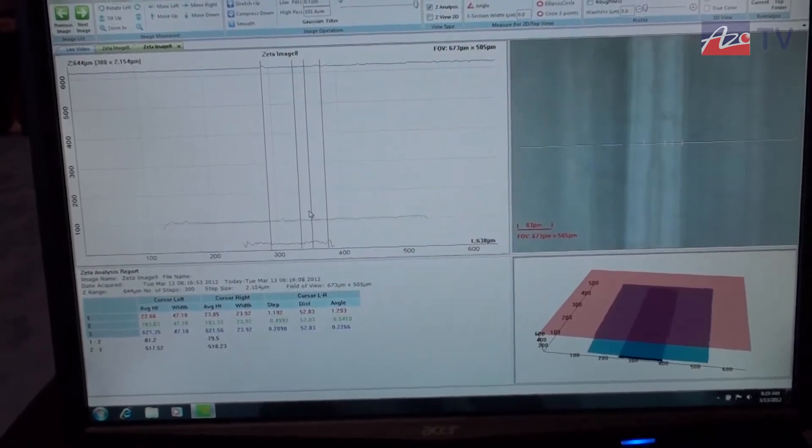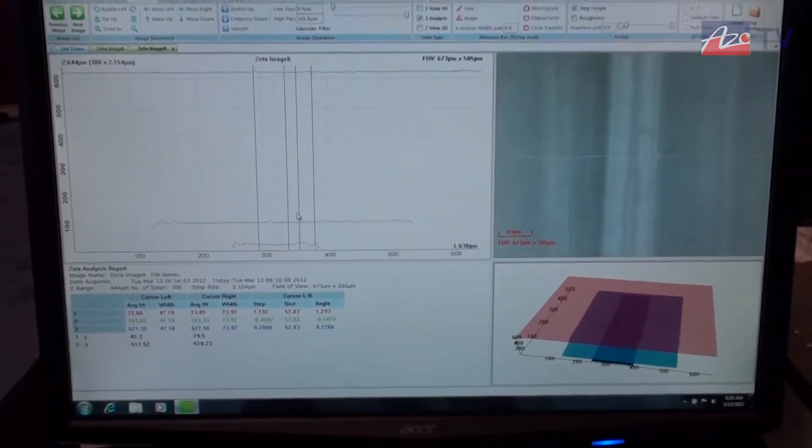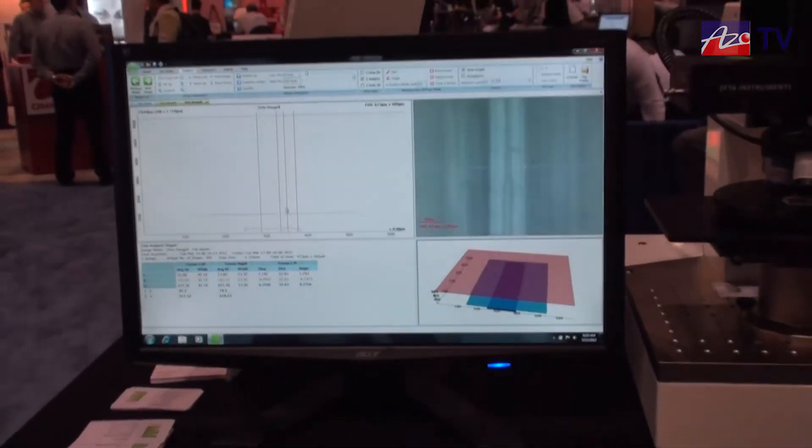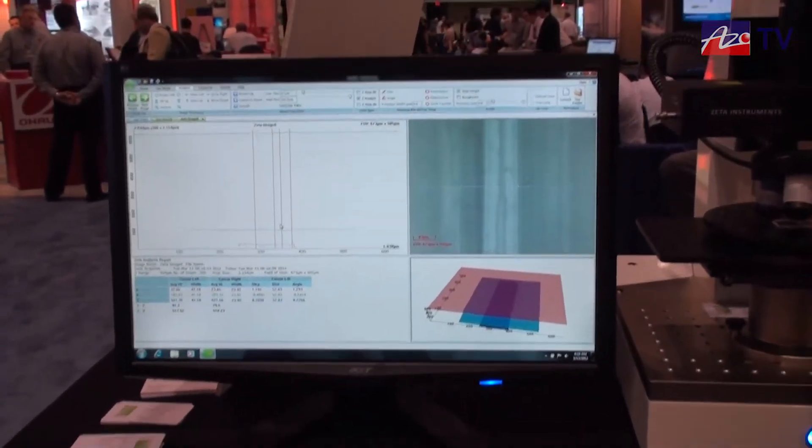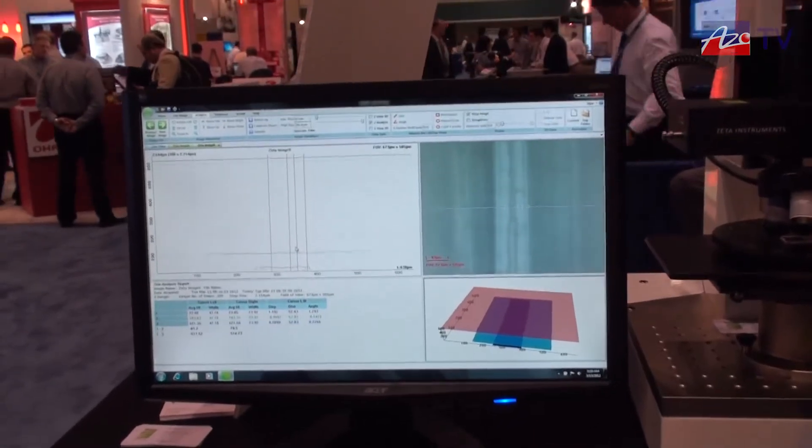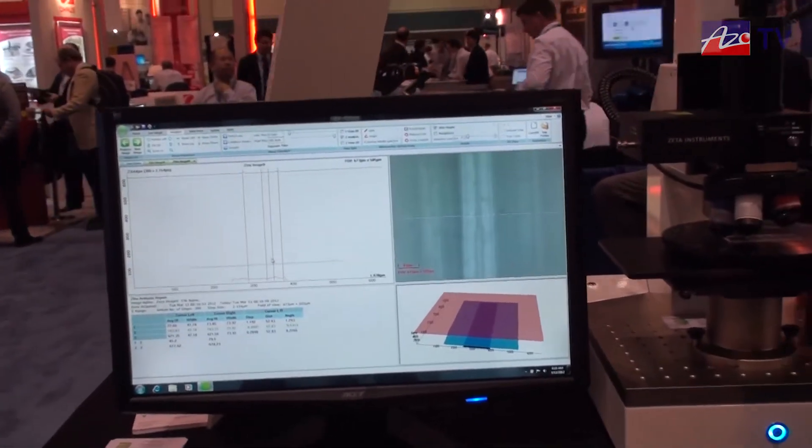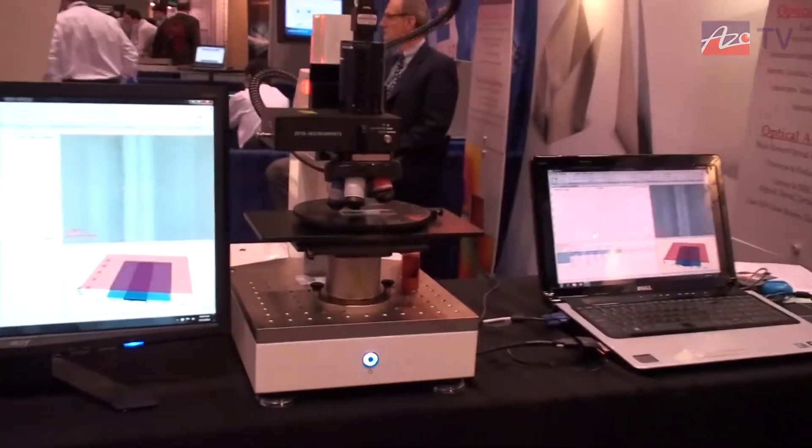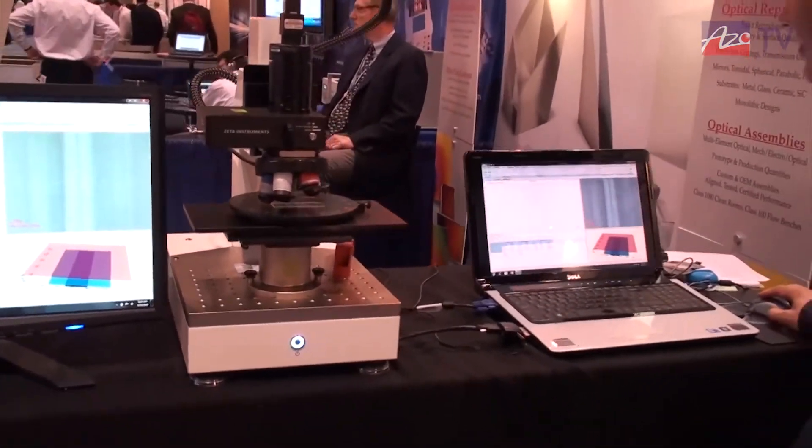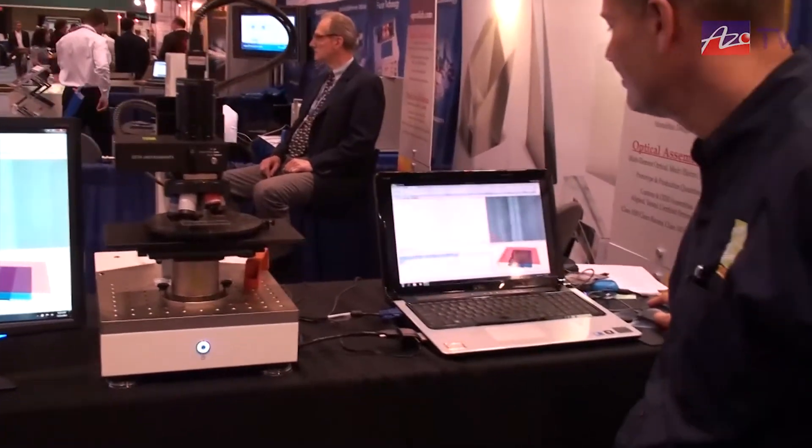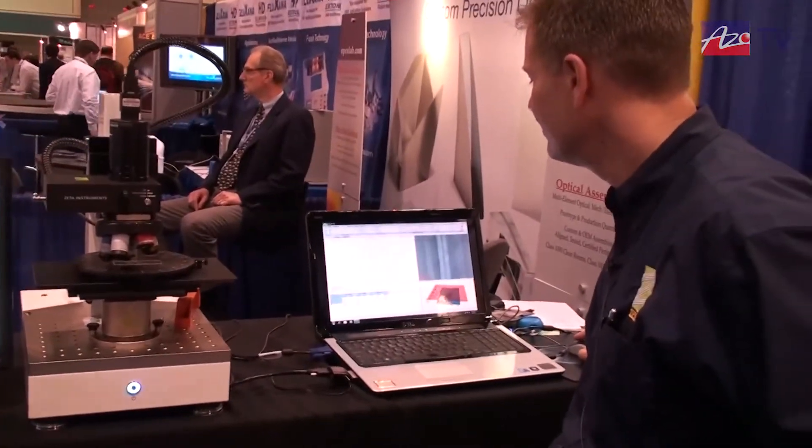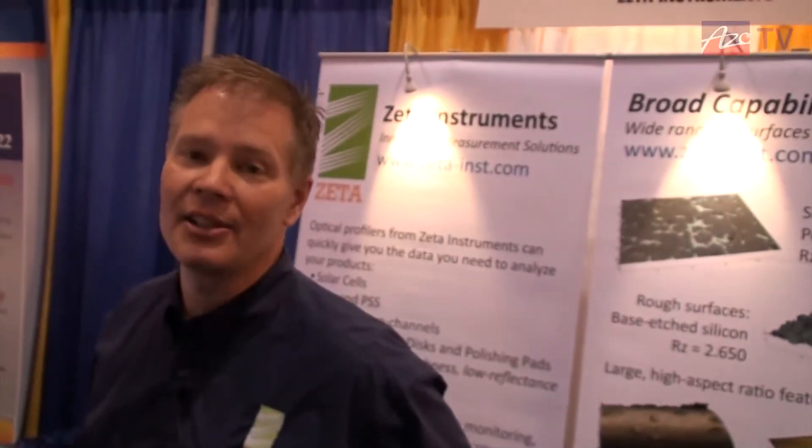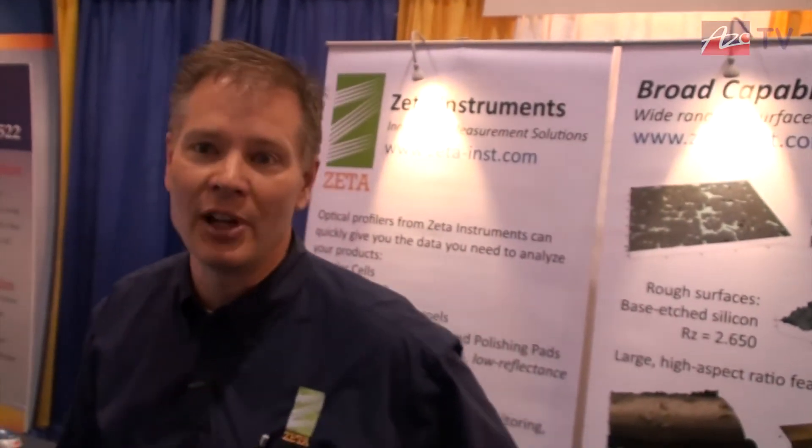So you can use that to calculate, you just did channel height, effectively. You could use it to calculate channel volume from a 3D map, presumably? Correct. So you can measure, basically, length, width, and height. If it's an open channel, you can calculate the volume.